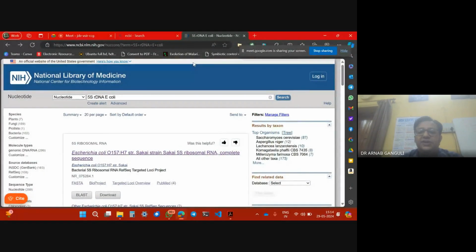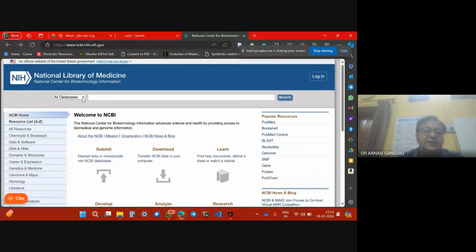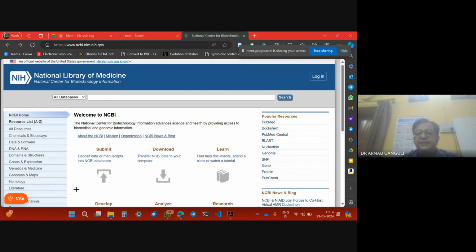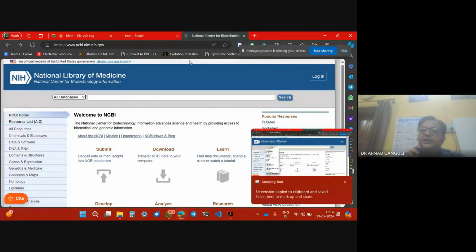I've taken a screenshot for you. I send this to you. Okay. So I'm again taking a screenshot from this. So I'll send these screenshots to you. Paste this on your lab notebook.